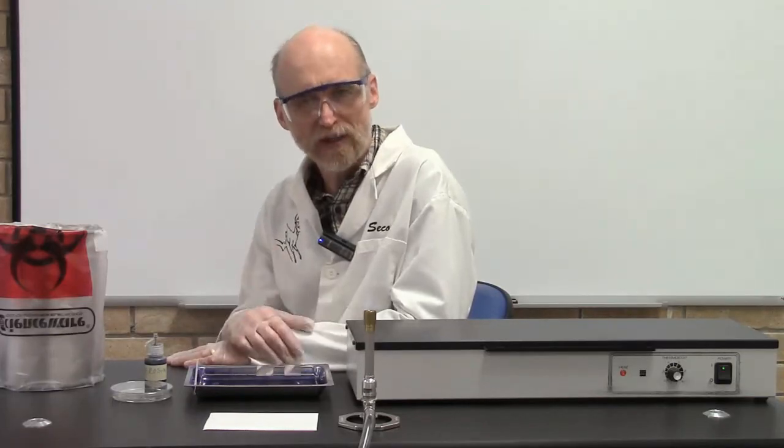In this video, we're going to look at the negative stain technique. The reason we use the negative stain technique is because it gives us a slide where the bacterial cell is very clear and distinct. You'll recall when you do a bacterial smear, you have to heat fix the slide. Anytime you use heat, it distorts the cells. With the negative stain technique, we don't use heat. So the cells come out more natural, and you get a much better image.